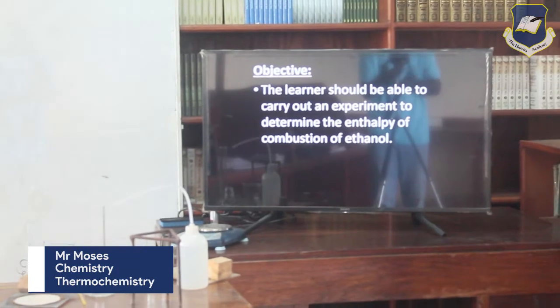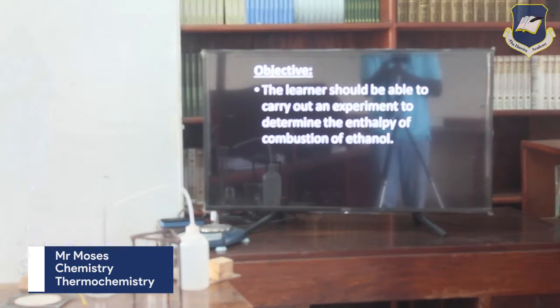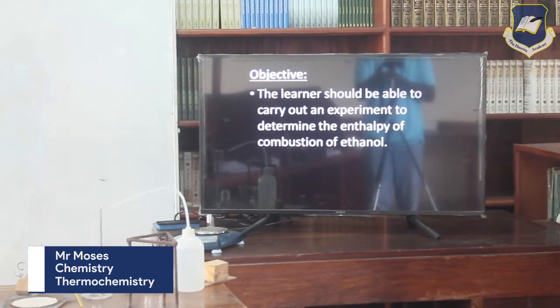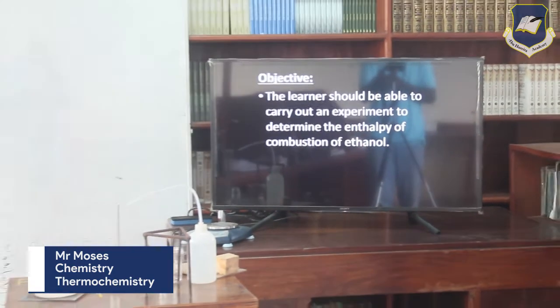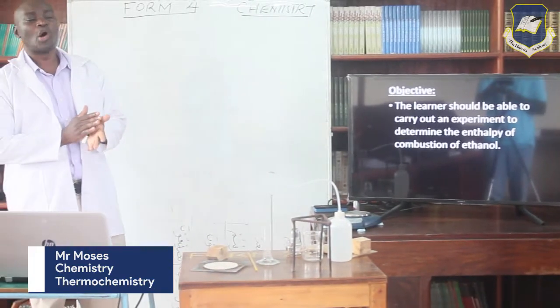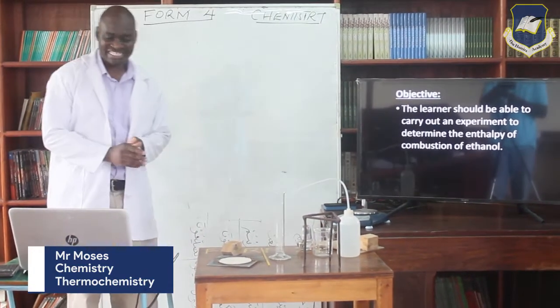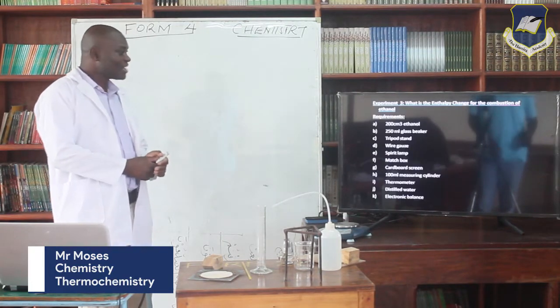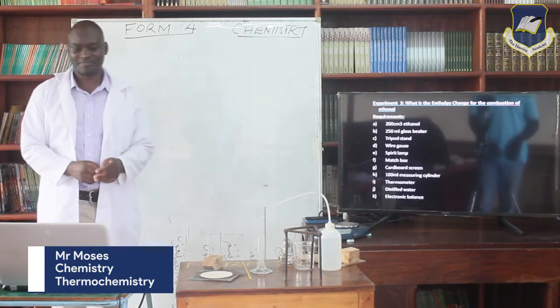Now, the objective of our learning today is that at the end of this experiment, you as a learner should be able to carry out an experiment to determine the enthalpy of combustion of ethanol. Now, we are going to carry out an experiment.